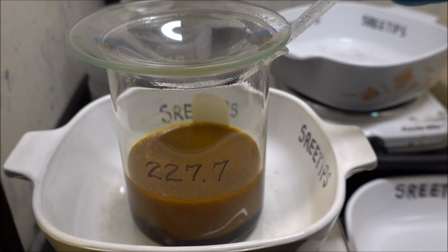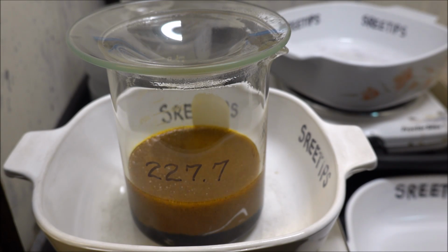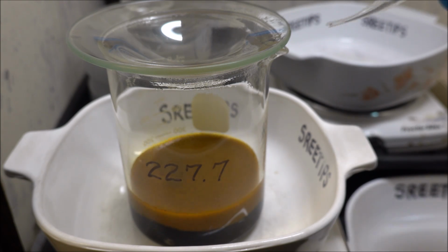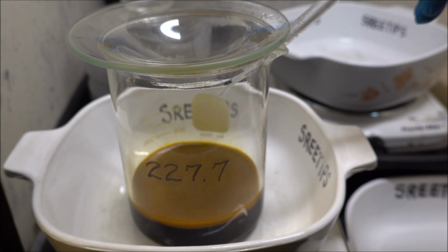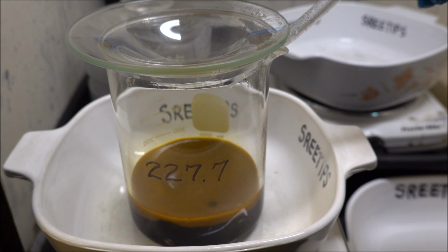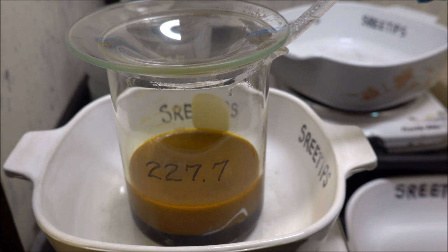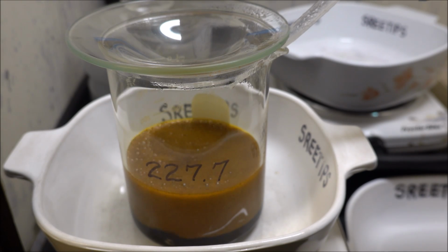It's not as vigorous. I've noticed that it calmed. It's not quite as reactive now. I think most of the metals have gone in solution. As I add the hydrogen peroxide, I can add a whole dropper here. If I'd have tried to do this in the beginning when there was a lot of metal in there, it would have overflowed on me. So that tells me I'm getting close to getting everything into solution.